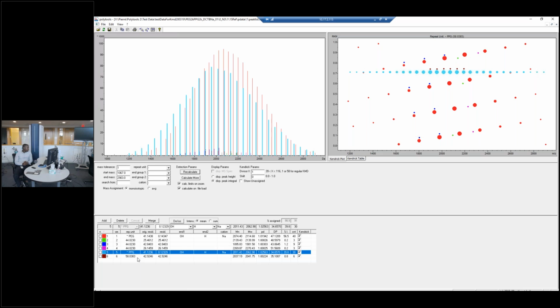There are two types of insoluble samples you can apply on a ground steel target. Something that's powdery mixed with the matrix, and all you need is just a little bit of that mixture, and you smear it onto the target pretty lightly. So that definitely won't cause any harm on the target.